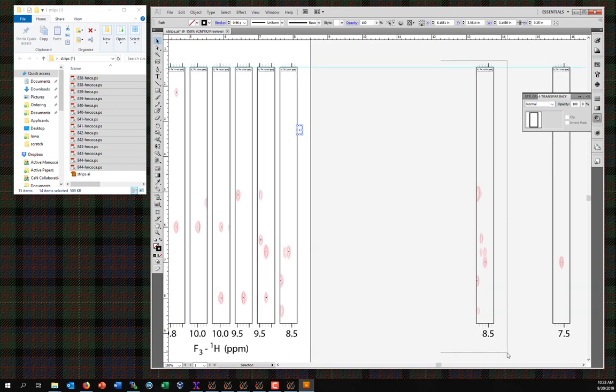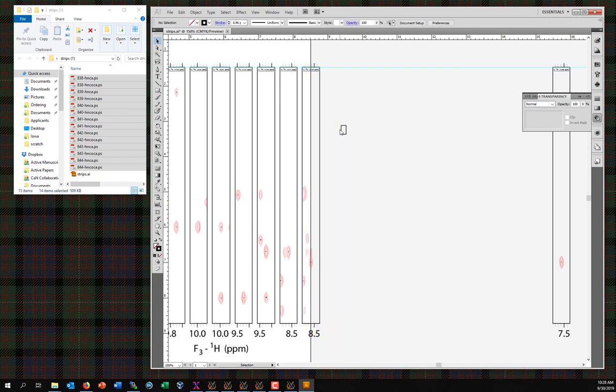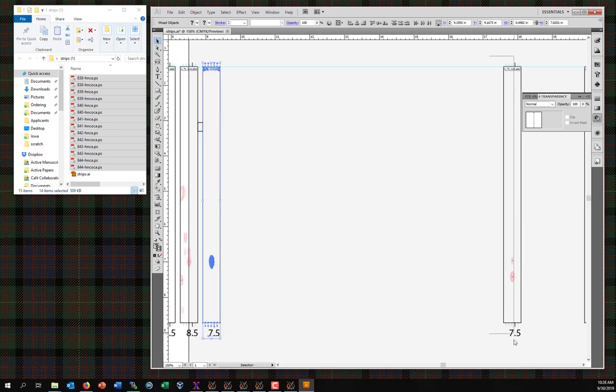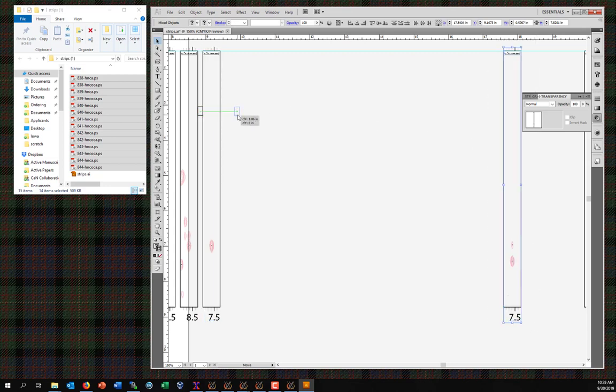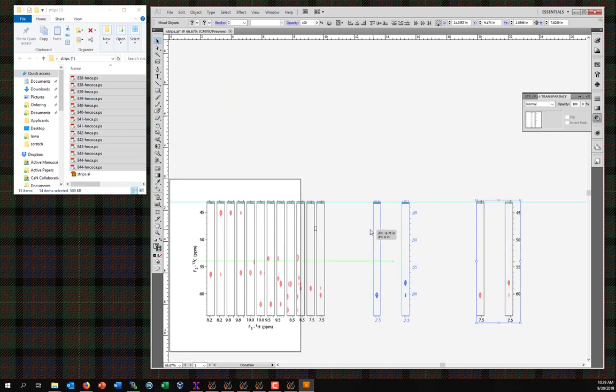The goal here when using Illustrator to do any kind of graphic manipulation of your graphs is to make sure that you're not manipulating your data at all. And so that's where the Smart Guides feature really helps you, because it means that you never have to worry about, if you adjust an axis label, is it really the same label spacing, or are you just fooling yourself and making it what you want it to be? Although certainly Illustrator does take practice. But we're just about done for this set of strips.